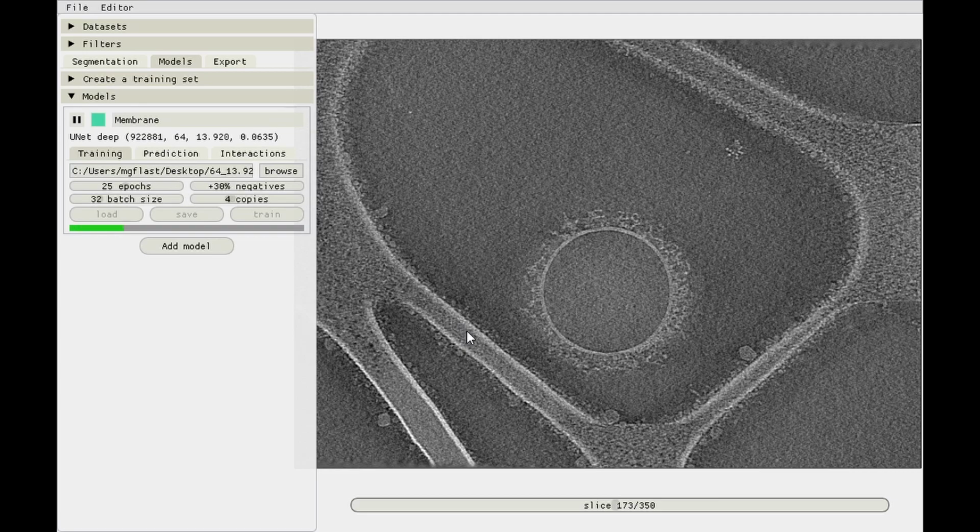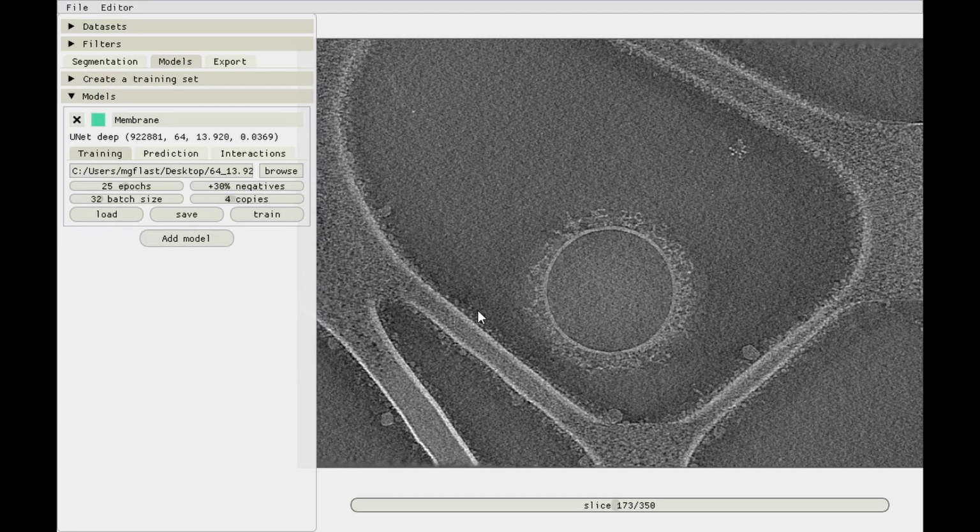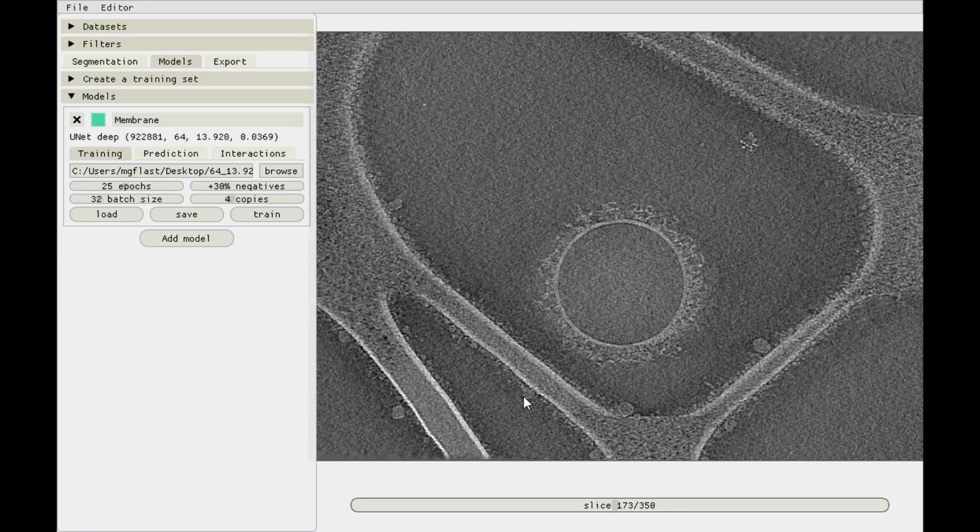First time can be a bit slow because that's when TensorFlow needs to initiate all kinds of stuff, and I had already done that before, so here it's a bit faster, but usually you may have to wait 10 or 15 seconds. And you can see the loss go down and the training progress bar fill up, and then within maybe 30 or so seconds the model is done training on a fairly small training data set, so it could have taken longer for a bigger one, of course.